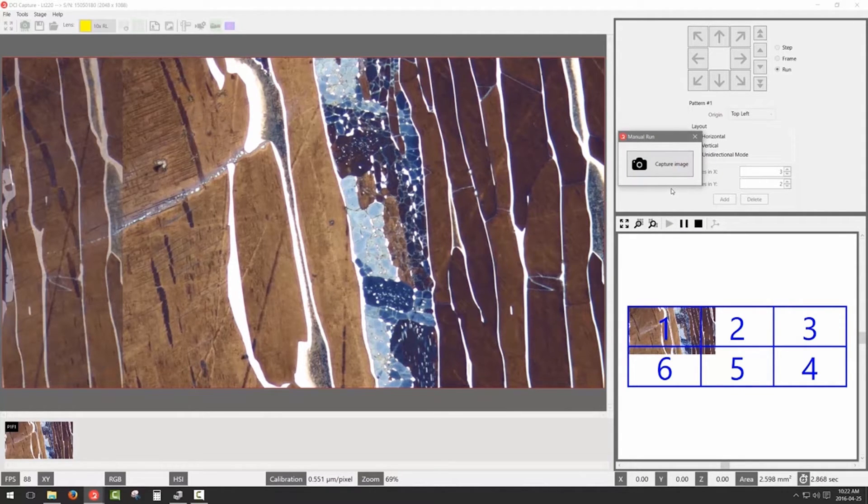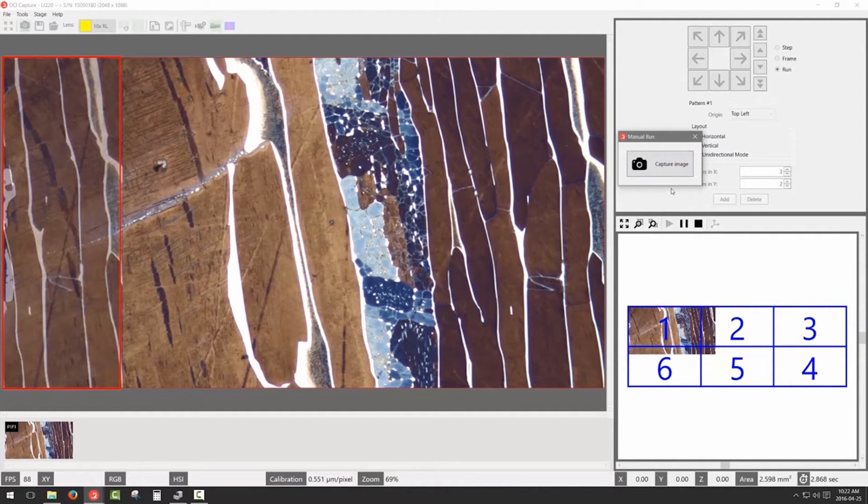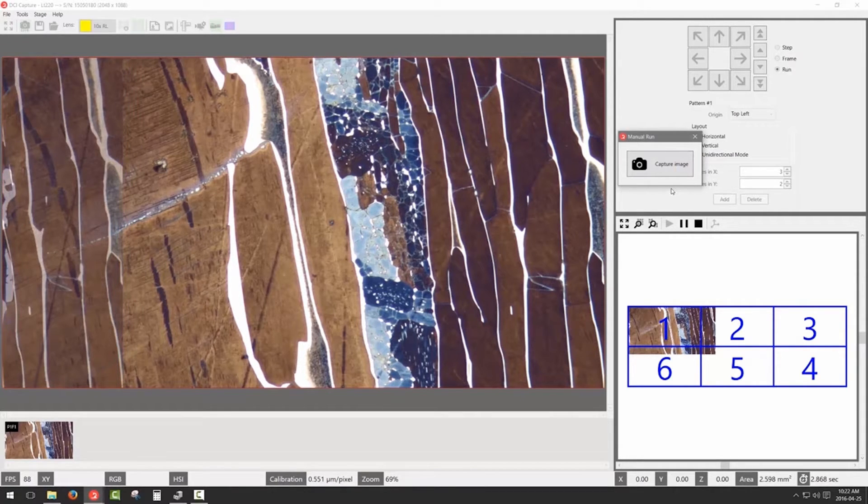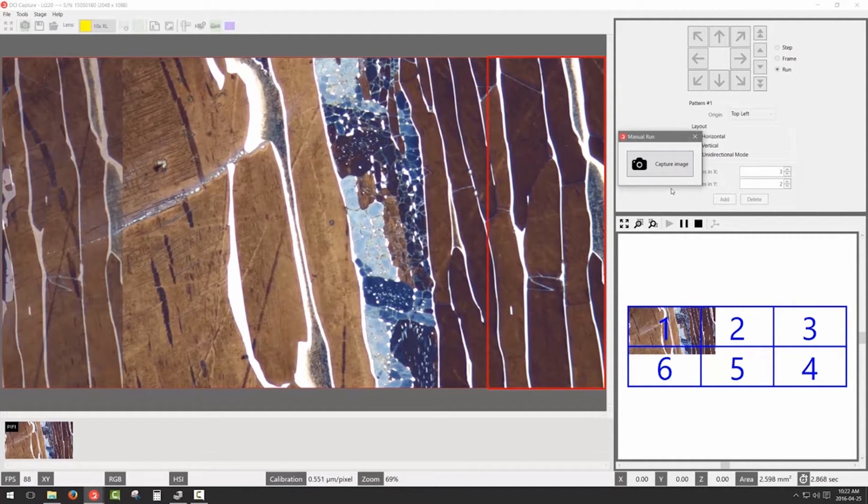Once you grab the first image of your pattern, a semi-transparent overlay will appear in your image window. This overlay will help you position the stage to acquire each of your images. It represents the image portion that you see in the red frame.